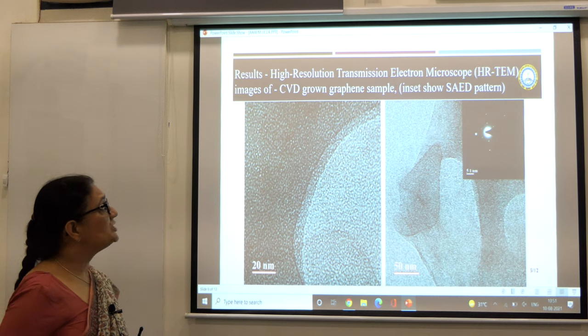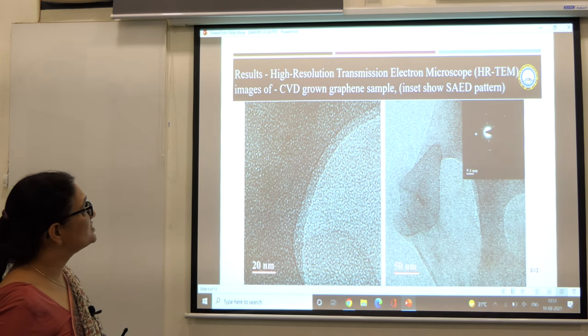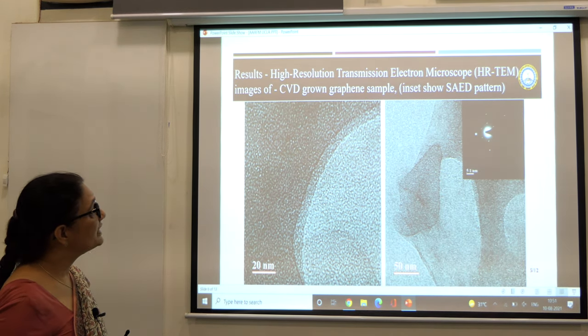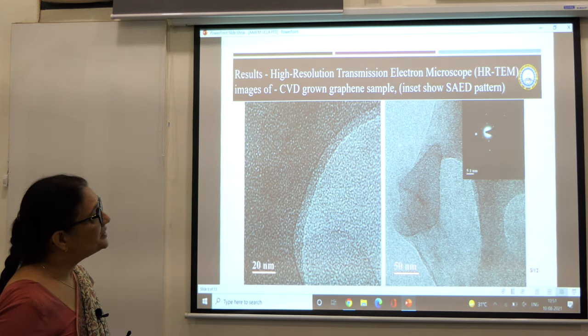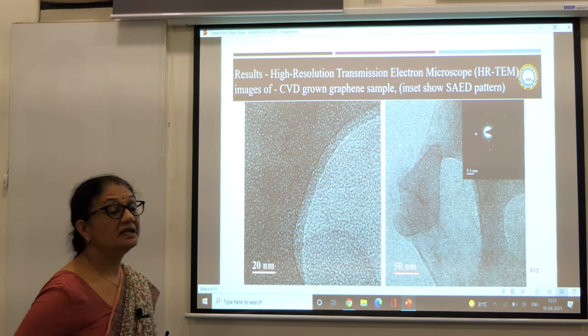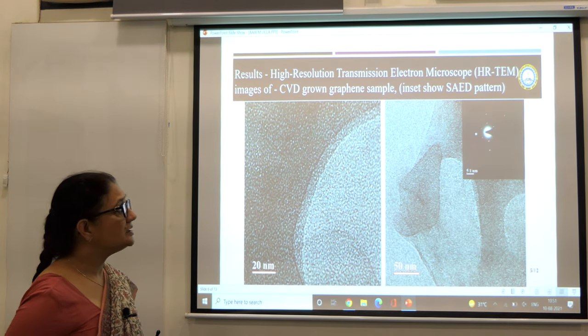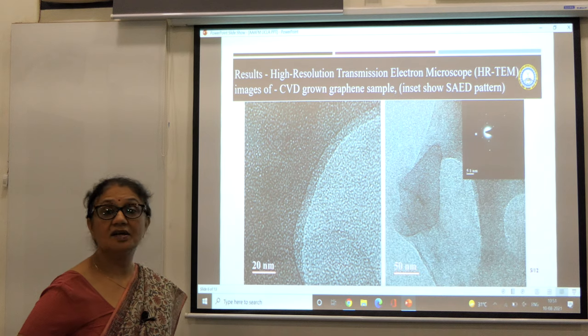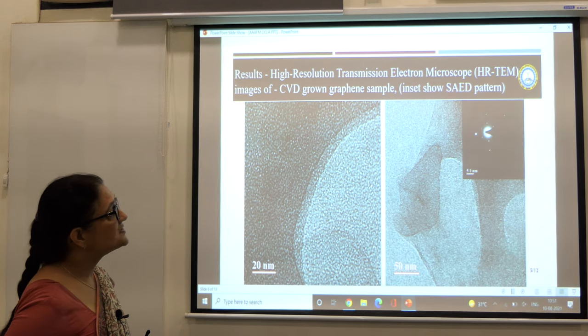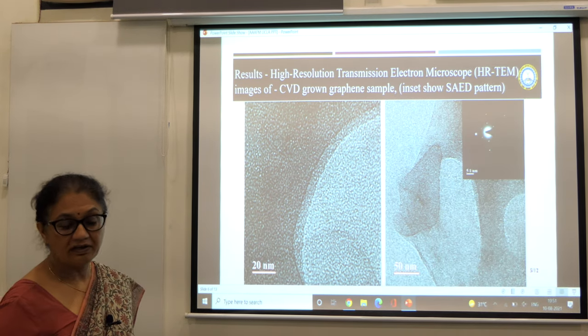These are the high resolution transmission electron microscope images of the CVD grown graphene sample. The inset gives you the SAED pattern, and the SAED pattern is giving you the hexagonal pattern which indicates the crystalline nature of the grown graphene.